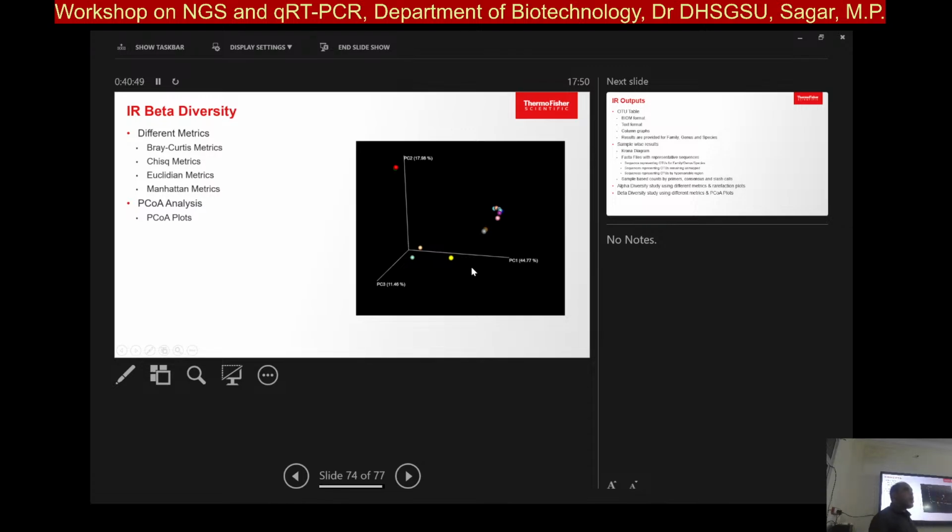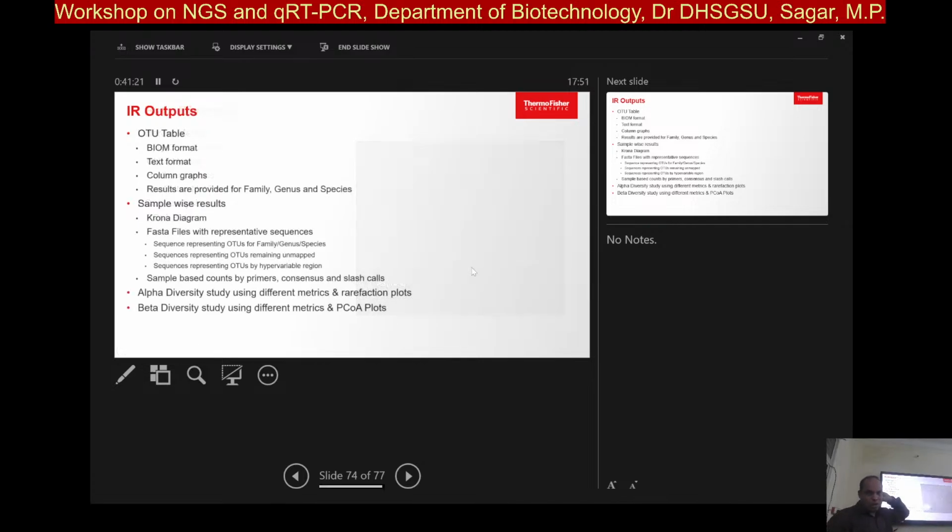Okay. So in this way, you're collecting information, and later on, after you get all this data, you like to compare. Compare between groups. Get those counts of those conditions, compare them. What would happen? It will start telling you which is highly occurring one, which are very low occurring one. So what is the normal has and what does the actual condition has? And that would give you more emphasis on writing your papers also. Okay. So that's how you like to use 16S data and come to this point particularly.